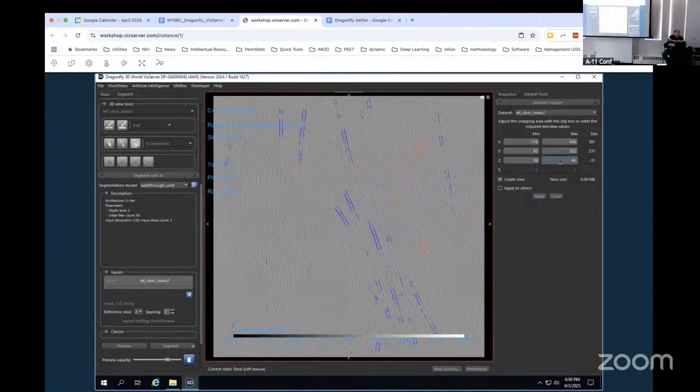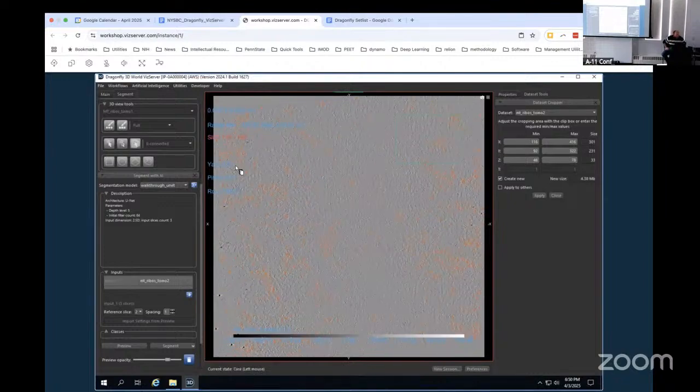Let me try one more thing. Yeah, I have no idea what's going on. I apologize. This is probably due again to being a different version. Well, I'm a little unsure of what to do if it won't go to the actual slice I'm telling it to.